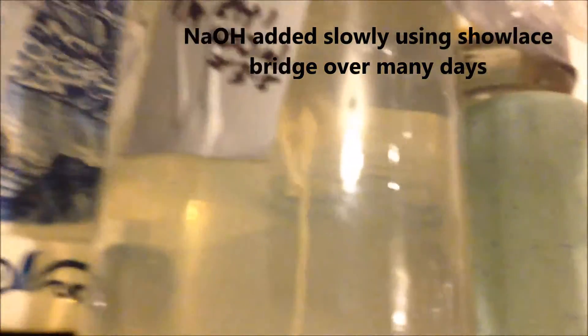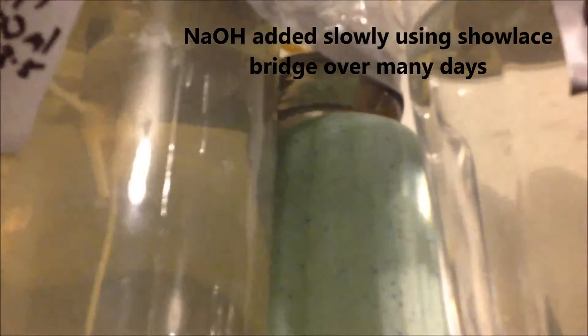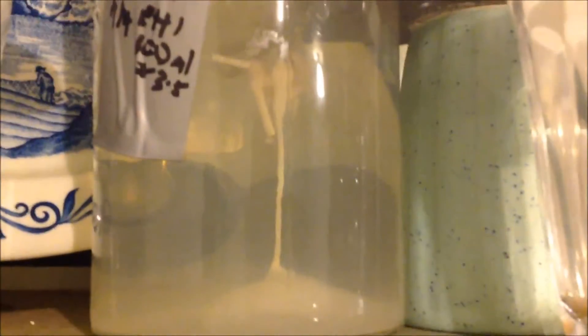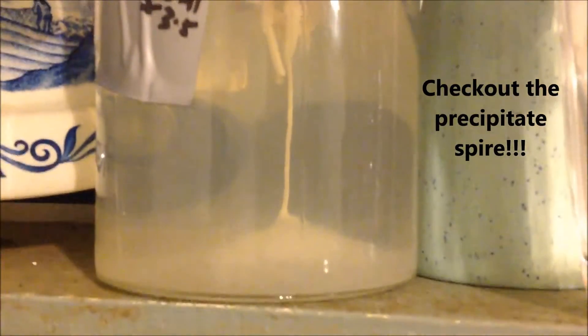Some sodium hydroxide is in a little piggyback jar that you might be able to see up there — yeah, there it is, centre top. It's slowly percolating through. It's been going for about 10 hours.